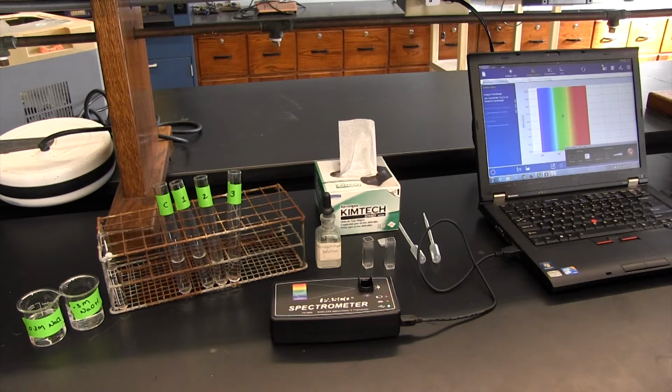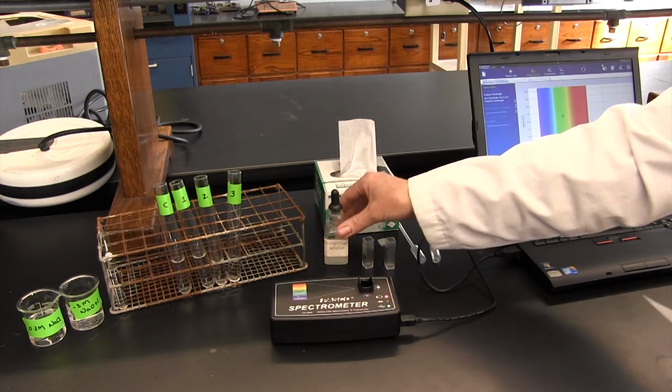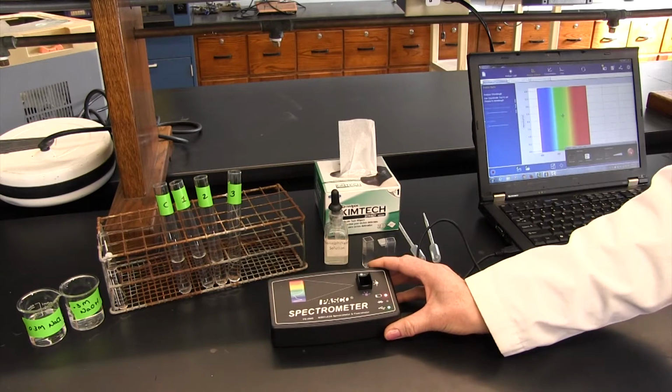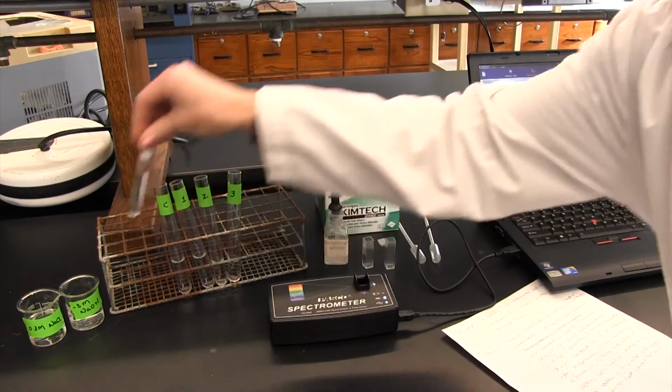The purpose of this experiment is to measure the reaction order and rate constant of a reaction involving phenolphthalein. To do this, we're going to use a spectrometer to monitor the reactant concentration. We can do this because our reactant is colored.